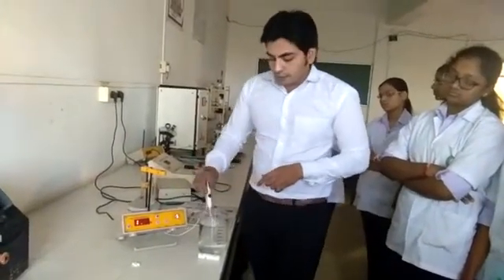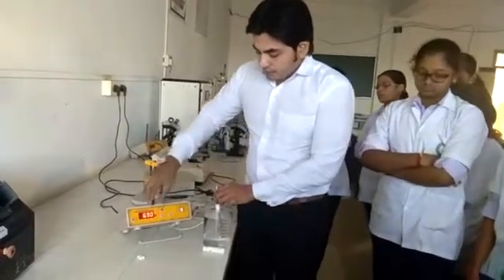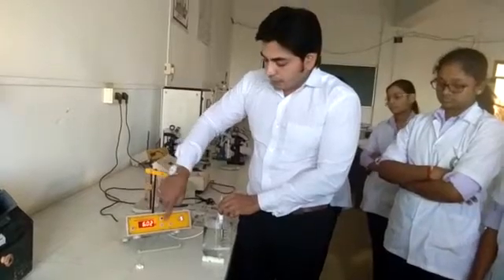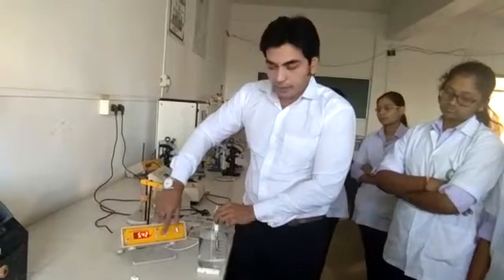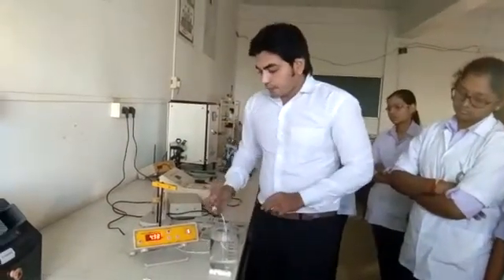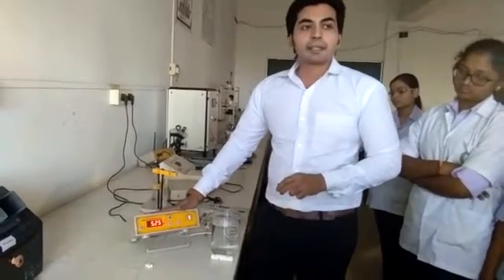Then leave this electrode inside the solution so that you can see the pH displayed on the display board. Then you have to adjust the pH using these two calibration knobs. After completion of calibration, you can say that this instrument is ready for your analysis.